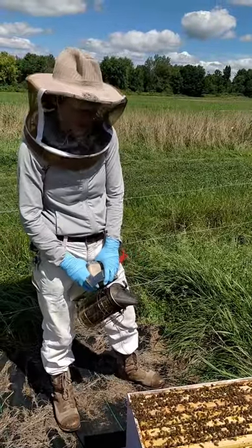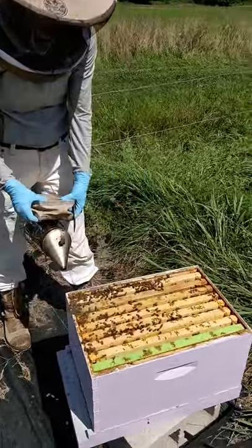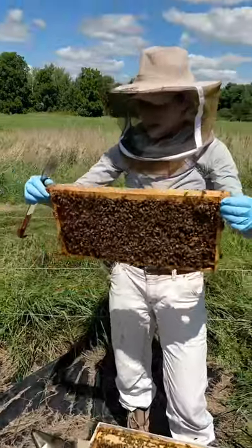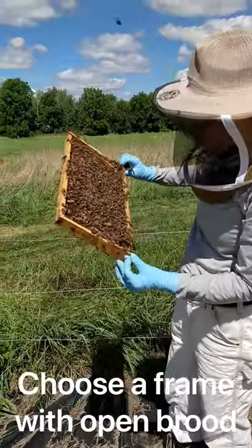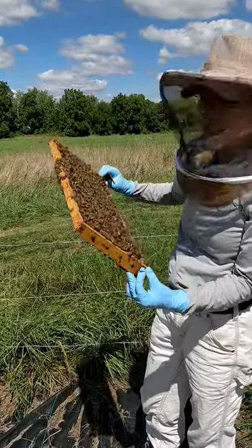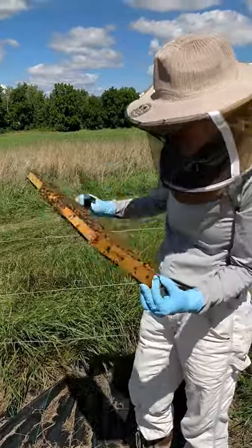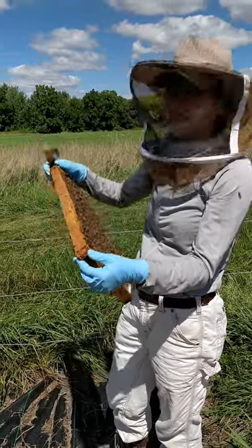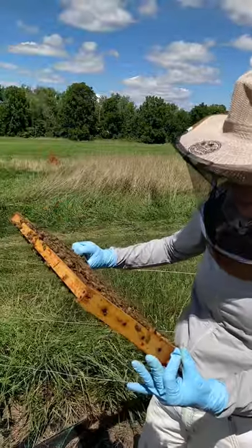The first step in doing an alcohol wash is to get down to your brood box and find a frame of open brood. I've got this frame and when I look on it, it's a mix of capped and open brood, which is perfect. Now the next step is you want to look to see if your queen is present, because you definitely don't want to shake her into the alcohol wash. I'm not seeing her, and if you have a partner out in the apiary with you, make sure to get both eyes on the frame so you don't kill her in this process.